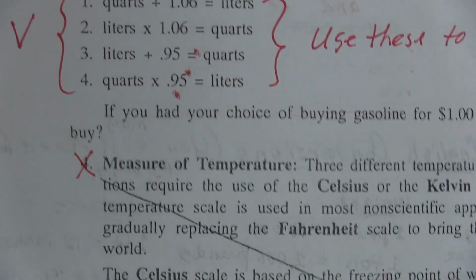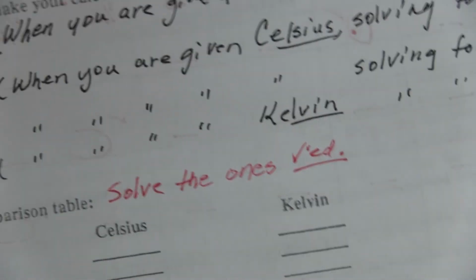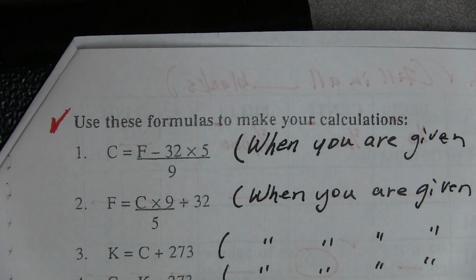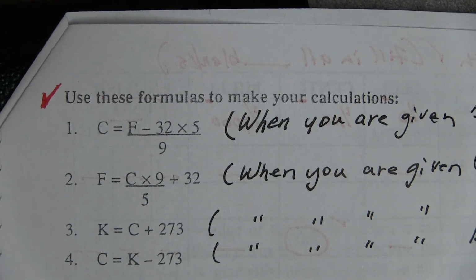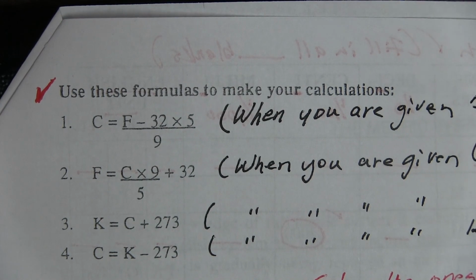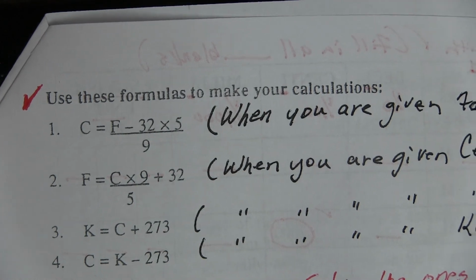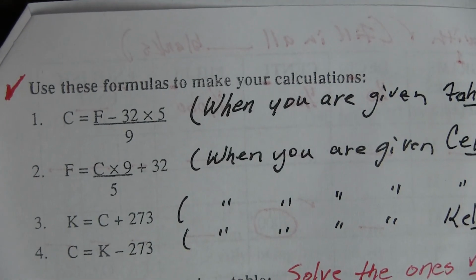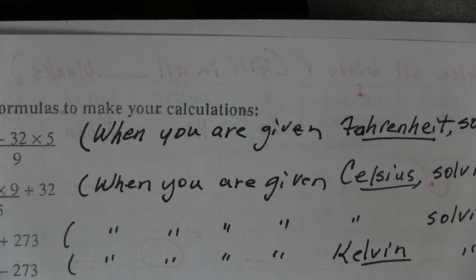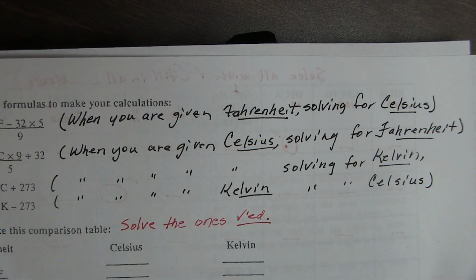And you don't have to worry about this procedure here. So turn the page. And these you will be using, and these are for conversions in temperature. Beside each one, so there's no confusion, I've written what each one will be used for. So let me zoom out, and then maybe you can see all of it at one time here.